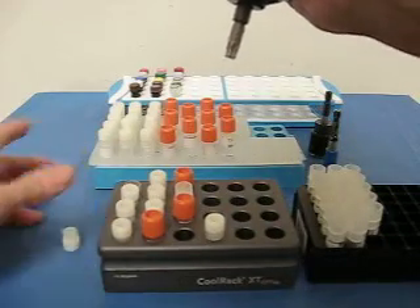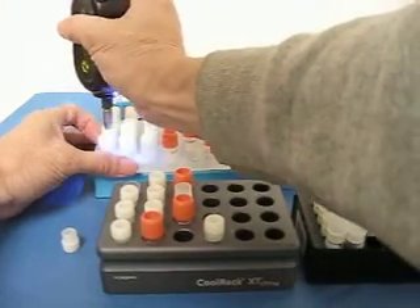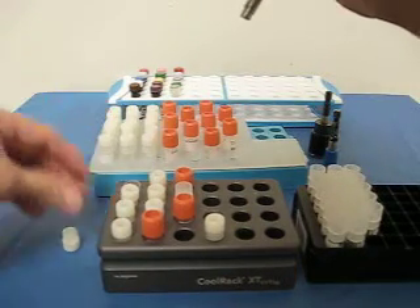Choir vials are sitting on bio-efficient cool racks. This is a different rack interlocking bio-efficient choir vials.